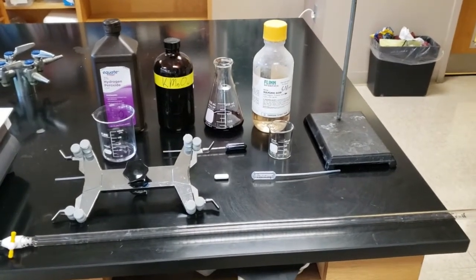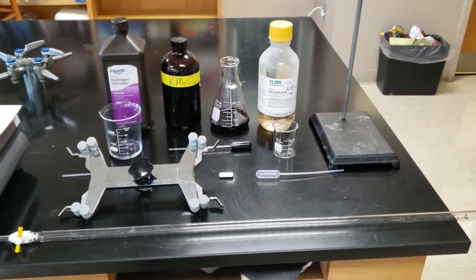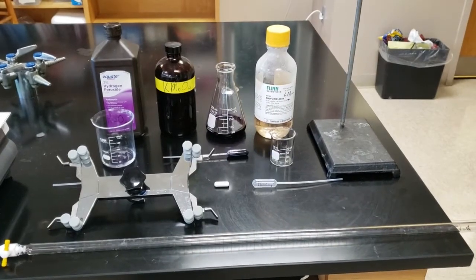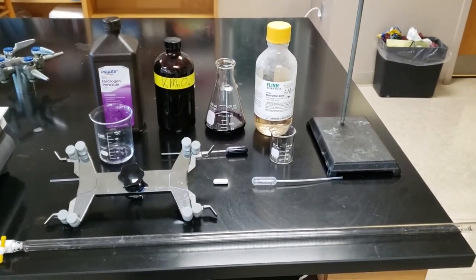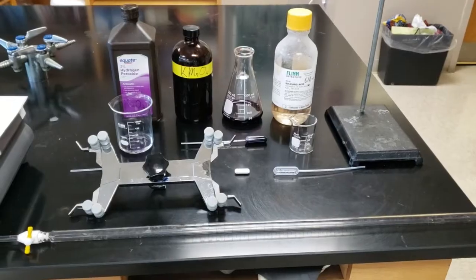Today we're doing a titration of 3% hydrogen peroxide with potassium permanganate. We're going to determine whether the 3% is an accurate measurement.